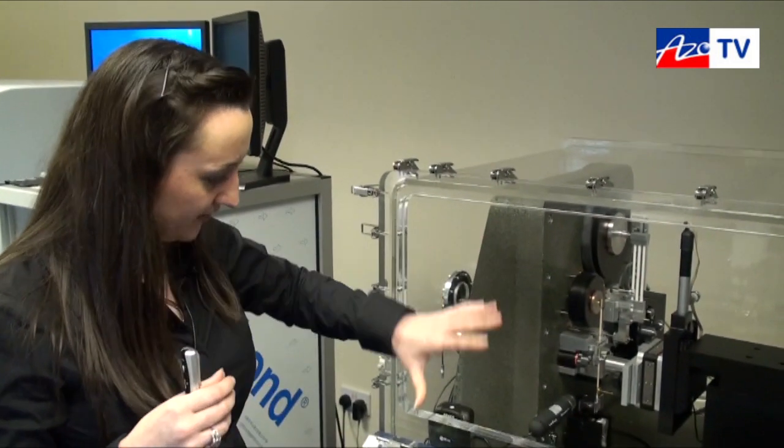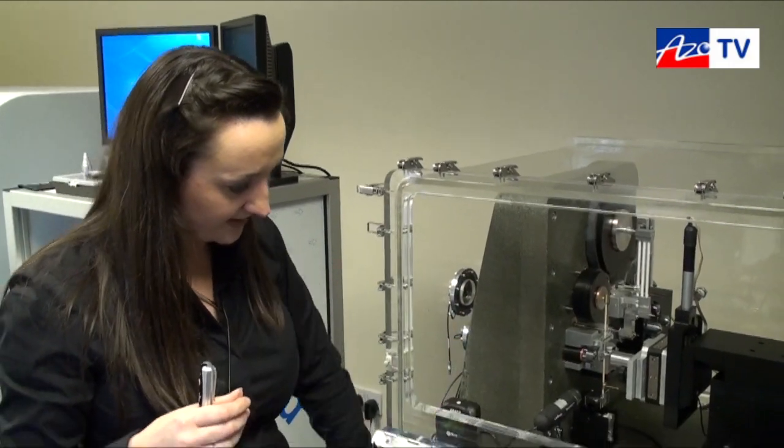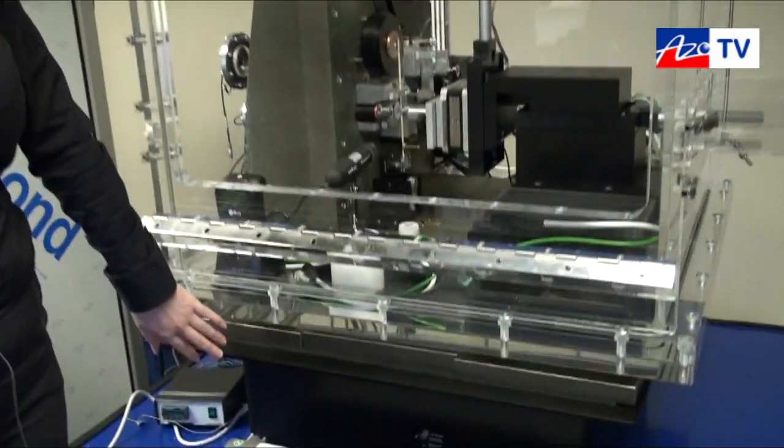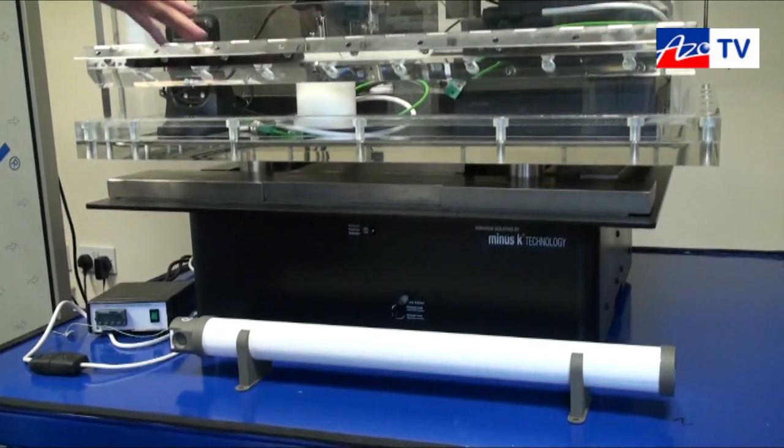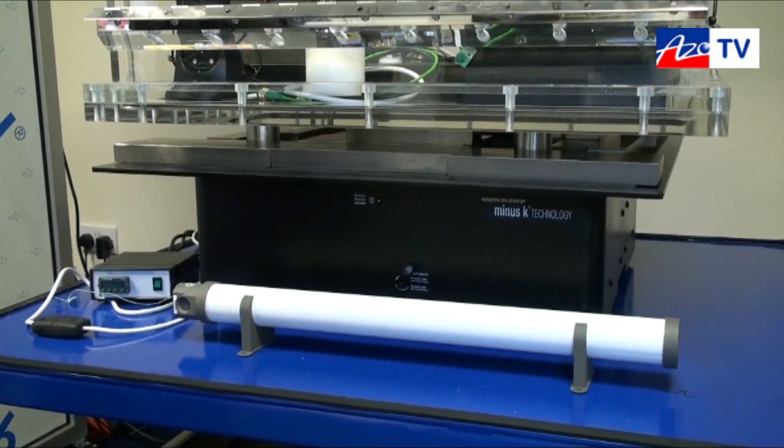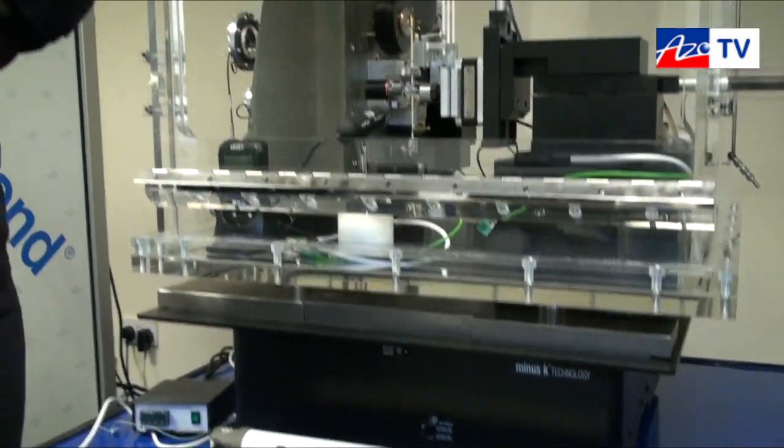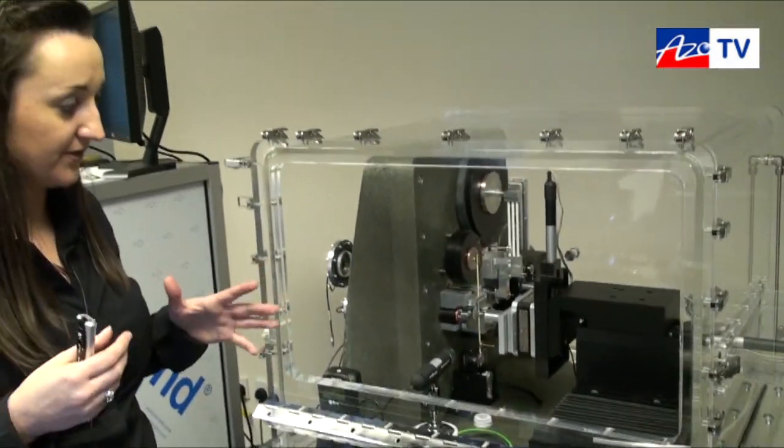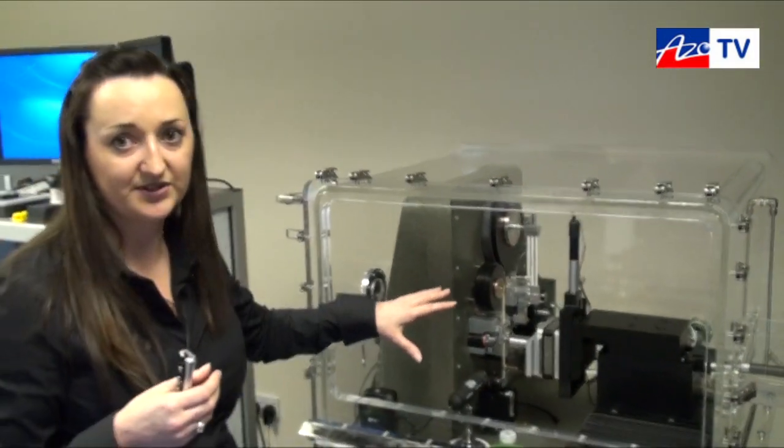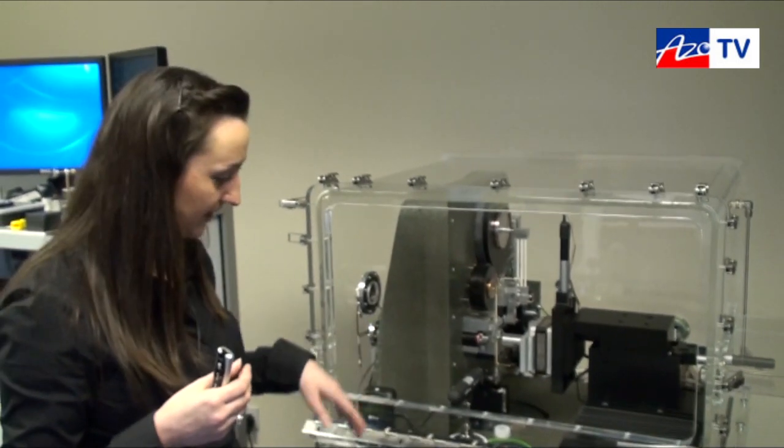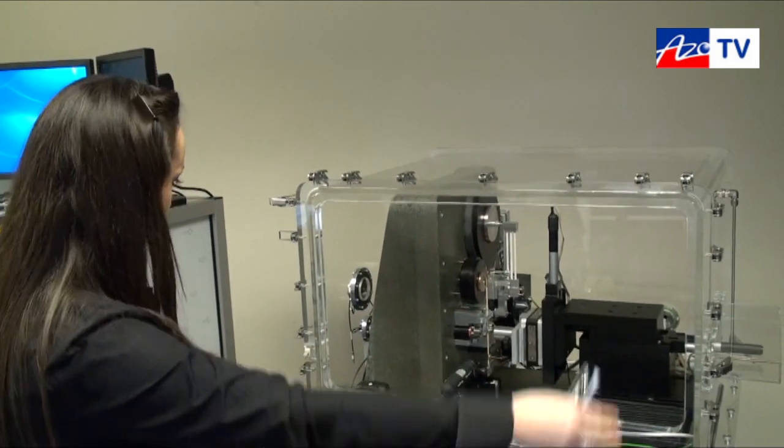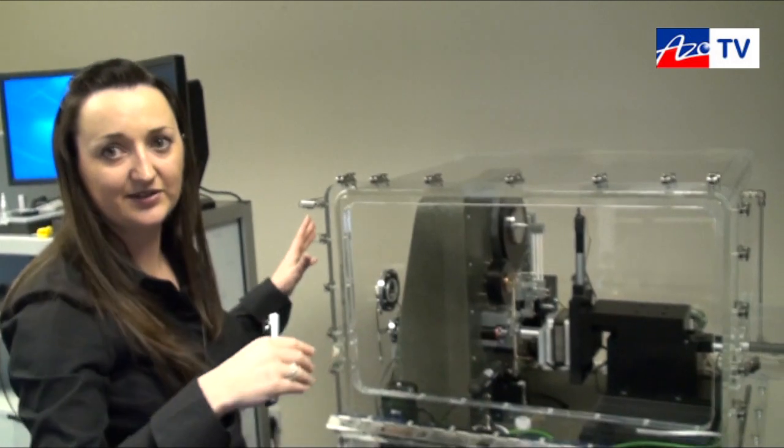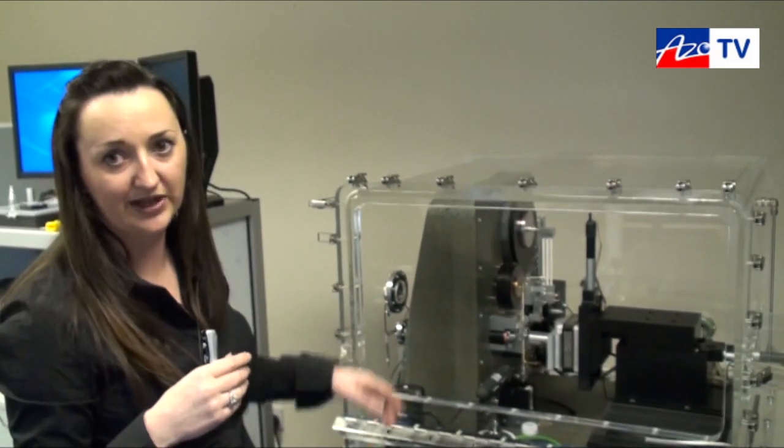So that's the instrument in a nutshell. All of that sits on an anti-vibration table. So the instrument is isolated in terms of acoustic noise and environmental noise and also in terms of temperature. The temperature inside this cabinet is controlled very, very closely. So typically on the instruments it would have one of those big cabinets on the outside. So all we're seeing here is the instrument without that cabinet.